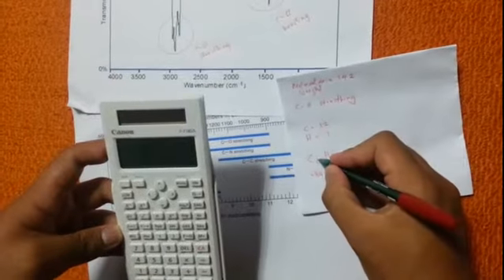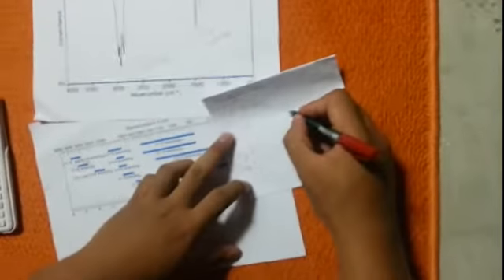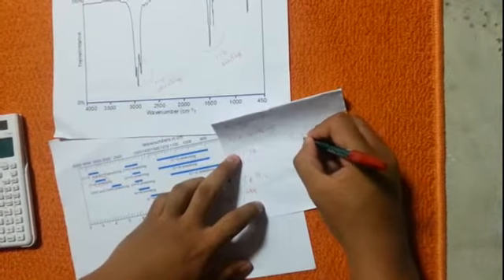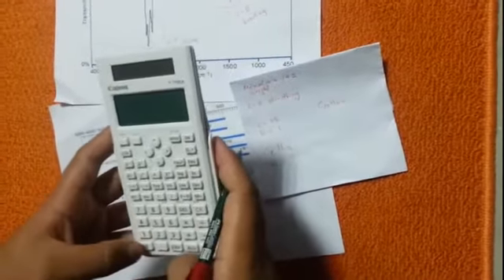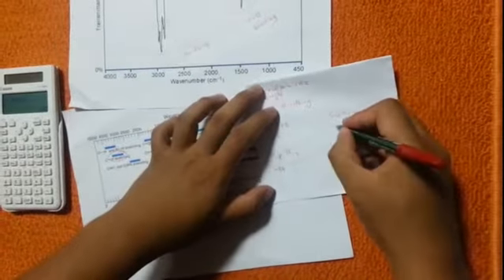So it's more than 6. So we try with C10H22. So it matches with the molecular weight.